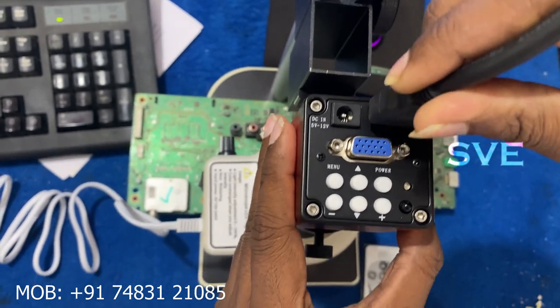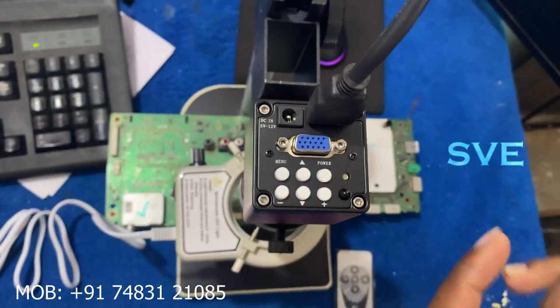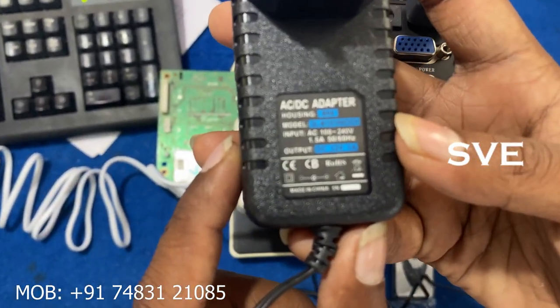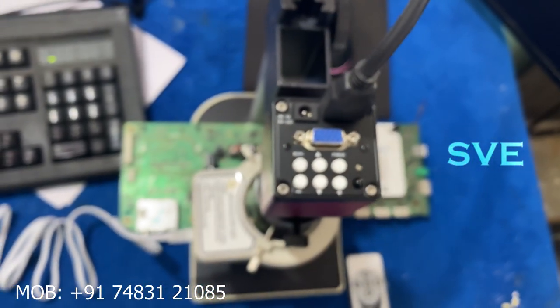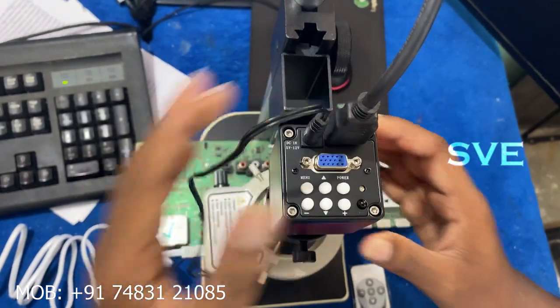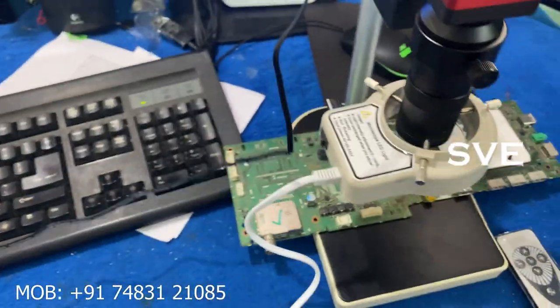Let's fix the HDMI here and connect the other side to our TV. And this is a 12V 1A adapter. Let's fix this in the microscope camera — it suits a 5 to 12V 1A adapter.